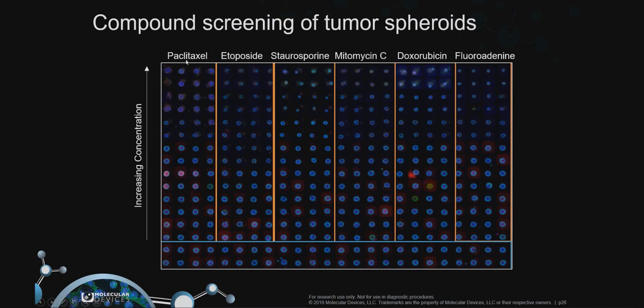And then we're looking at screening different compounds to see the viability here and the effect on the spheroids to be a measurement of the viability, how they change the shape, the number of cells, and so on for these different compounds, with each having different mechanisms. So as I mentioned, this is an interactive montage. So you click on the areas and you see the full resolution images. So immediately we can see that these spheroids do look different.